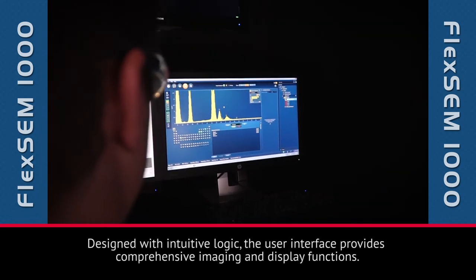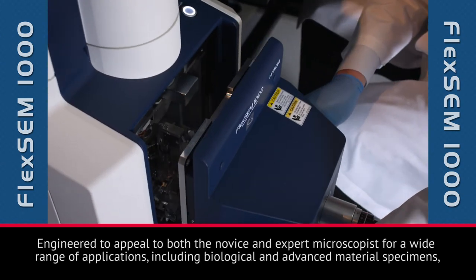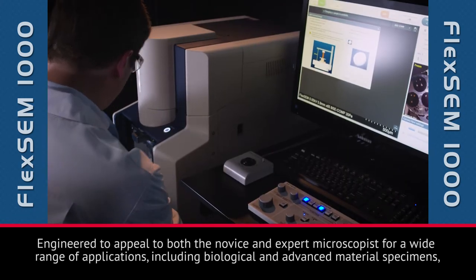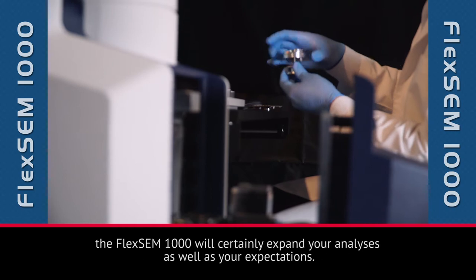Designed with intuitive logic, the user interface provides comprehensive imaging and display functions. Engineered to appeal to both the novice and expert microscopists for a wide range of applications, including biological and advanced material specimens, the FlexSEM 1000 will certainly expand your analyses as well as your expectations.